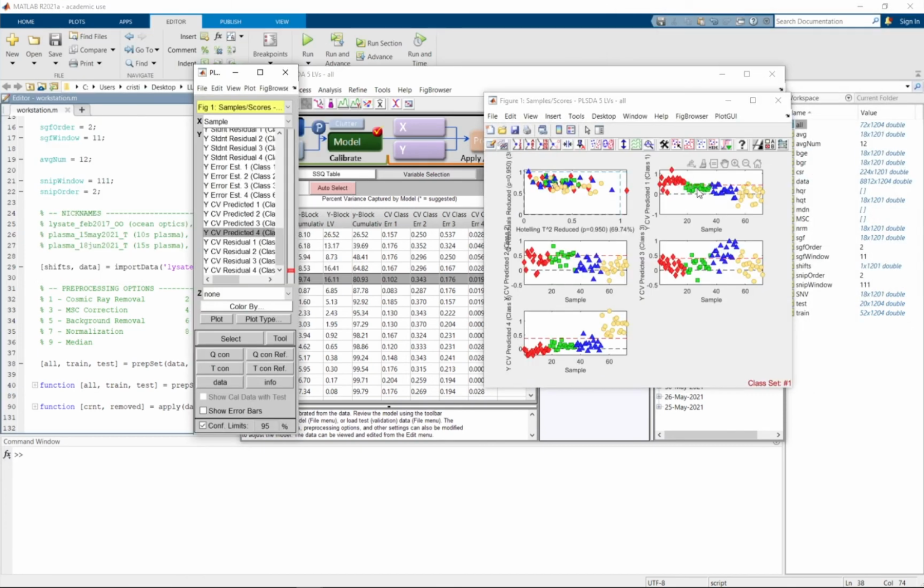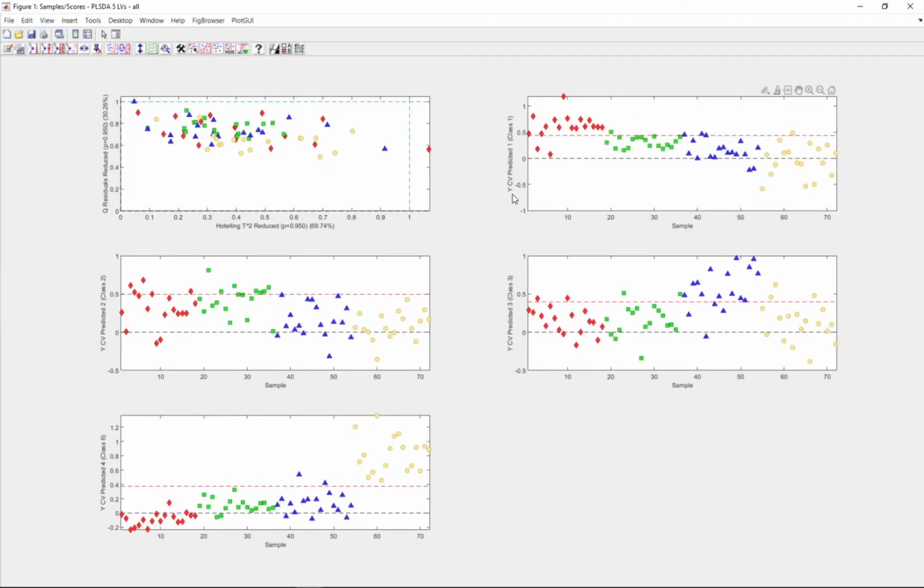So now we have a lot more plots, and that's because we have 2 more classes that we're trying to predict for. So I'm going to open this in full screen. You just want to pay attention to the y-axis label so you know what that specific plot is trying to predict. In this case, it's trying to predict for the first class, so that's the one there, and our first class is class 1, our 0 gray data. So everything above the red line, it's classifying as 0 gray.